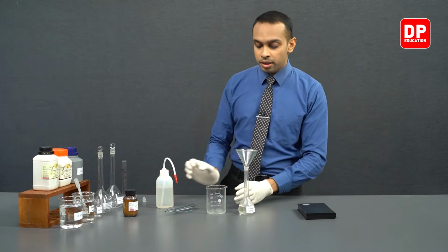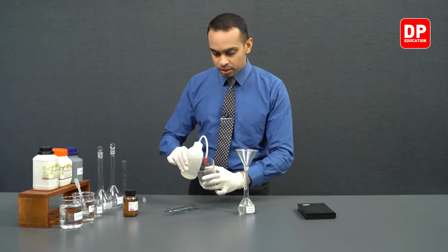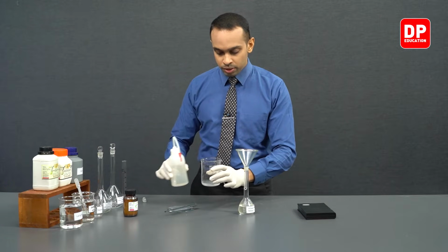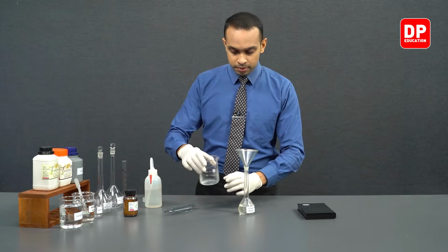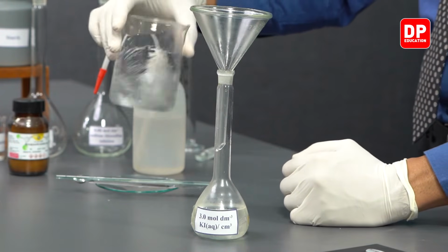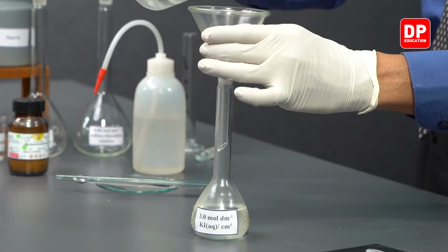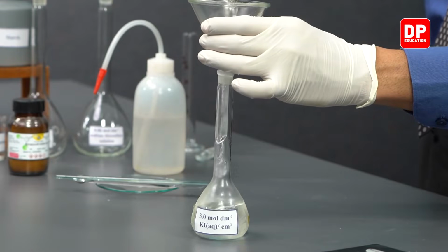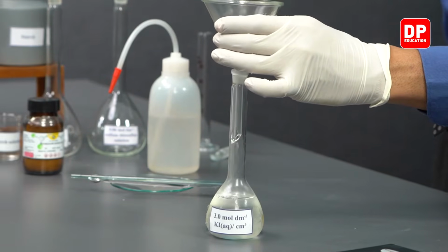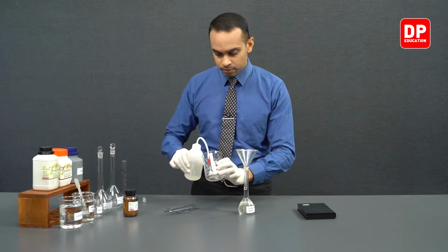After transferring the liquid into the volumetric flask, we can rinse this beaker one more time with a little bit of distilled water to make sure all of our potassium iodide is transferred into the volumetric flask. We can repeat it once.